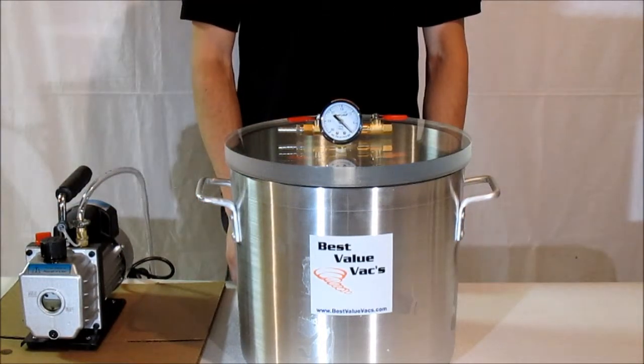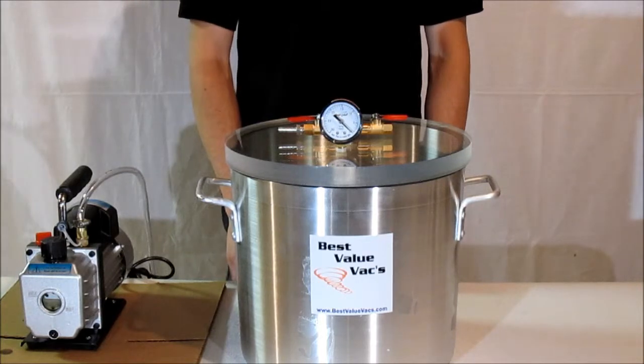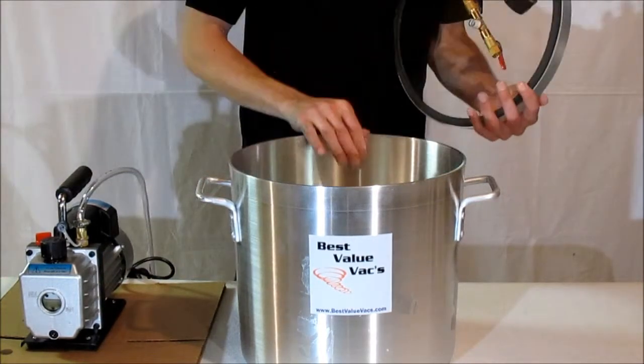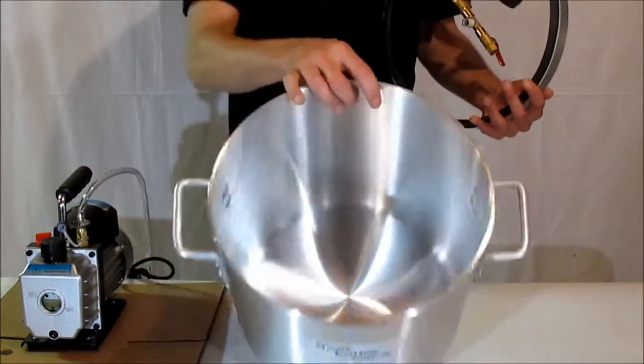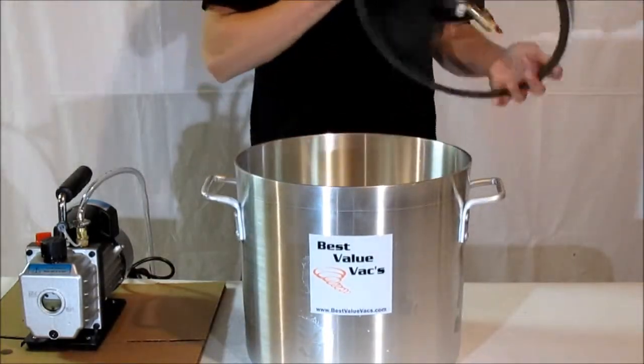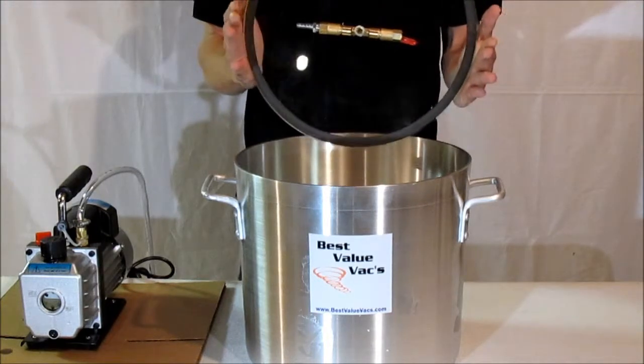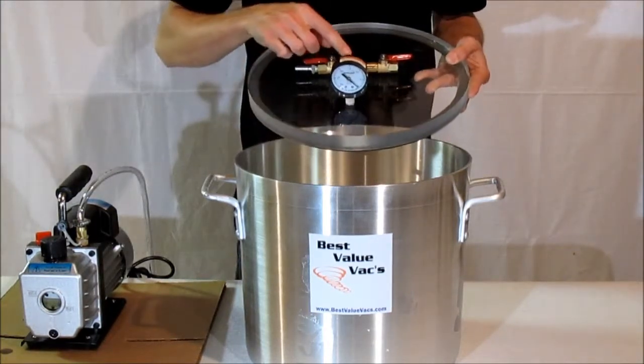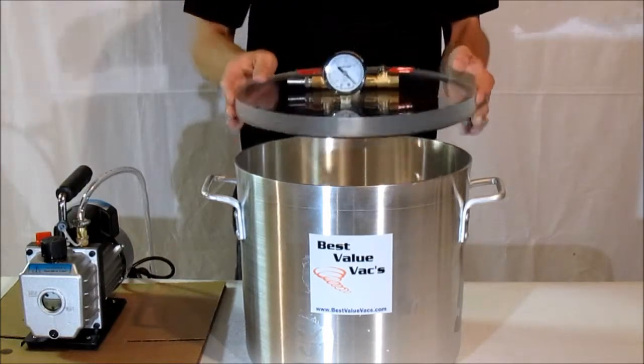This is a demonstration video of the Best Value Vax 5-Gallon Vacuum Chamber. The chamber is a 5-gallon pot-style chamber with a heavy-duty acrylic lid and a rubber gasket on the bottom. You have your gauge assembly, the valve body with hose bar, and two valves.